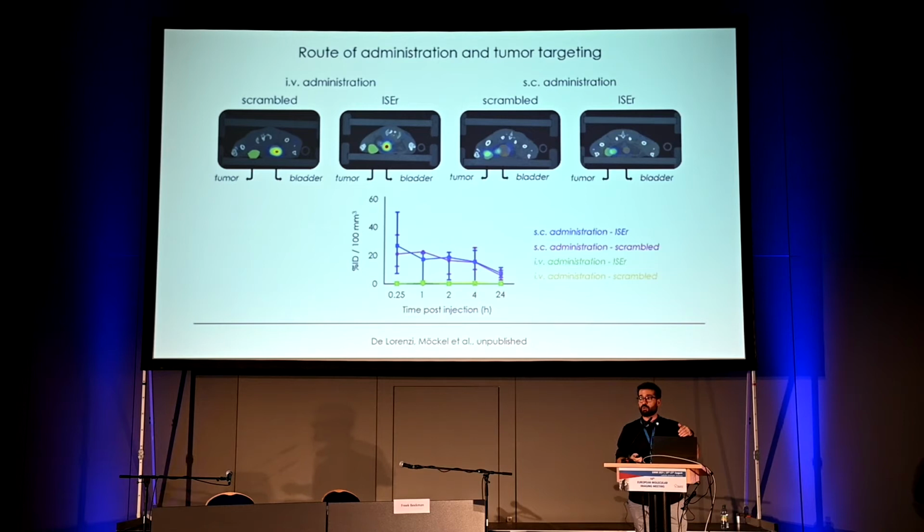So we expect it to have an easy way to the tumor, although the immune system engager might meet other immune cells on the way to the tumor, and then of course the targeting would be lower. But it's very positive that we don't have any actual differences there.